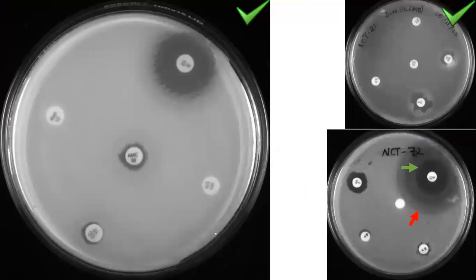So after that, use the same broth culture for antibiotic sensitivity test. You might be wondering why to go for antibiotic sensitivity when you are characterizing a bacteria. Say, for example, if you are working with 10 bacterial species isolated from a soil sample, and you want to distinguish your bacteria, you need to collect as much data as possible.